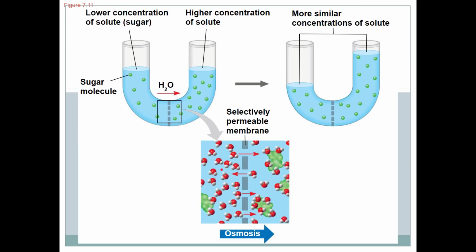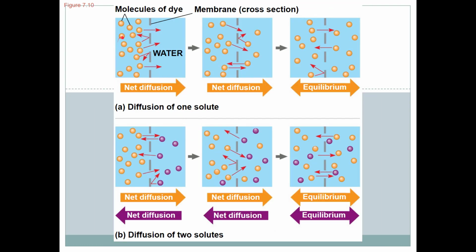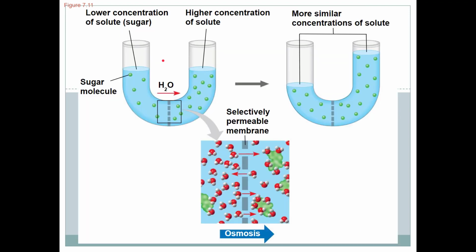What we're measuring in this lab experiment is not just basic diffusion, but osmosis. Osmosis is the diffusion of water across the membrane. So when would that happen? Because we didn't really see that here. We saw the solute, the dye, moving across the membrane. But what would happen if you made these pores smaller and the dye could no longer fit through those openings? That's what we have happening in this example.